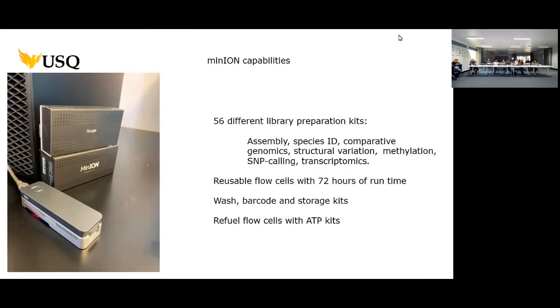So it's really flexible. A couple of other things, the flow cells for this, unlike MiSeq, they're actually reusable. So for whatever reason, if you start a sequencing run, you run it for 6 hours, and you've got enough data there to answer your question, you can actually stop it. So these are designed so that you can just run them for as long as you need to before you can stop it. You don't have to run it for the full 72 hours like you might with MiSeq. You can actually stop these, wash them, and store them, and use them again.